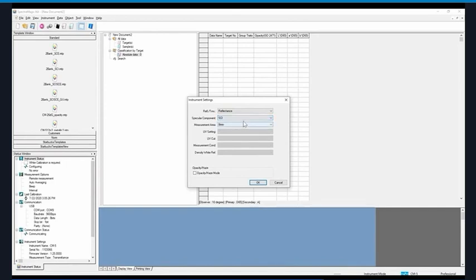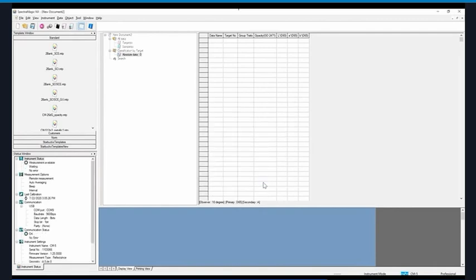We'll choose SCI. The option for SCI plus SCE will disable the ability to measure opacity. We cannot measure SCI and SCE simultaneously if we're going to measure opacity. Then we make sure that the measurement area matches the target mask on the instrument. And finally, because we want to measure opacity, we'll make sure that we tick the opacity haze mode. Then we can click OK to confirm our settings.